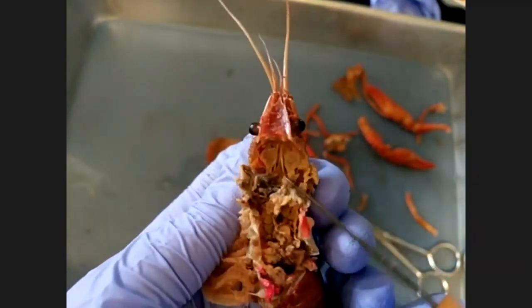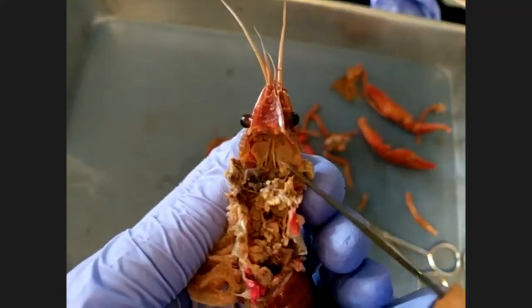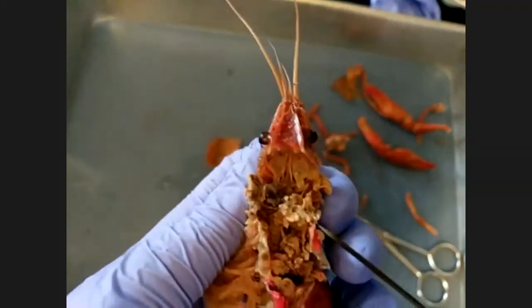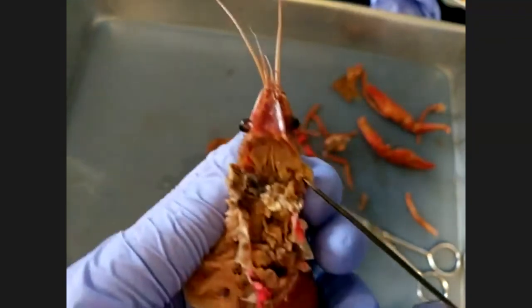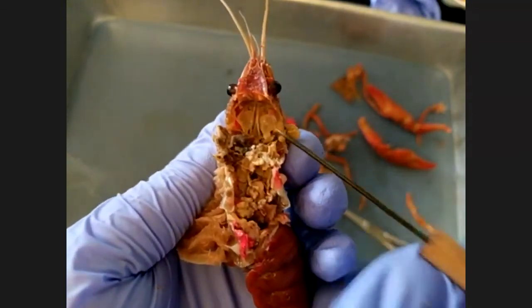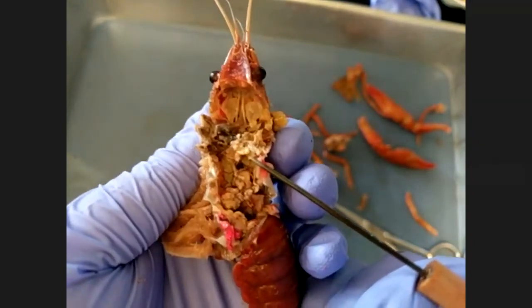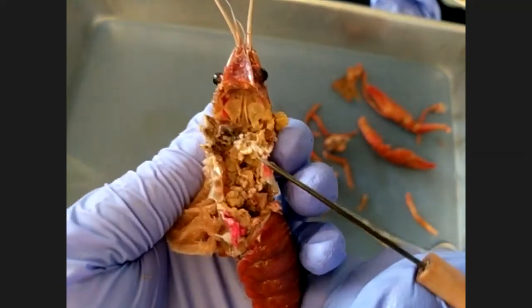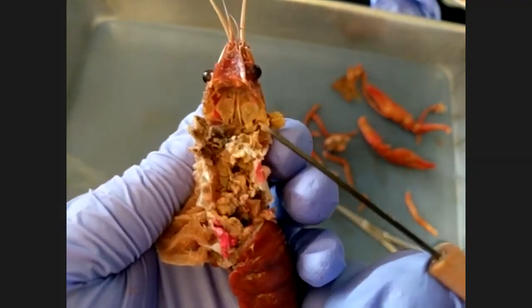Anyway, there are two really important glands right here to the left and right of the nerve cords. These are called green glands. Notice how they're called green glands, but they're not actually green. One of the really annoying mysteries about why we named them that. The green glands are responsible for filtering out waste from the blood. So I want you to think, how do the kidneys work? That's how these green glands work. They work the same way.